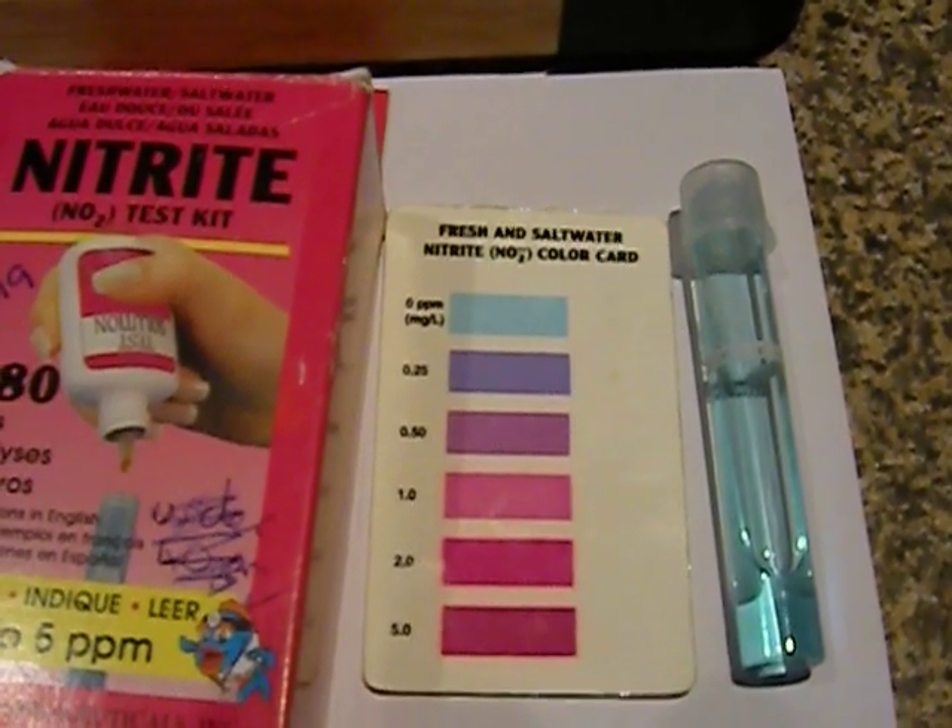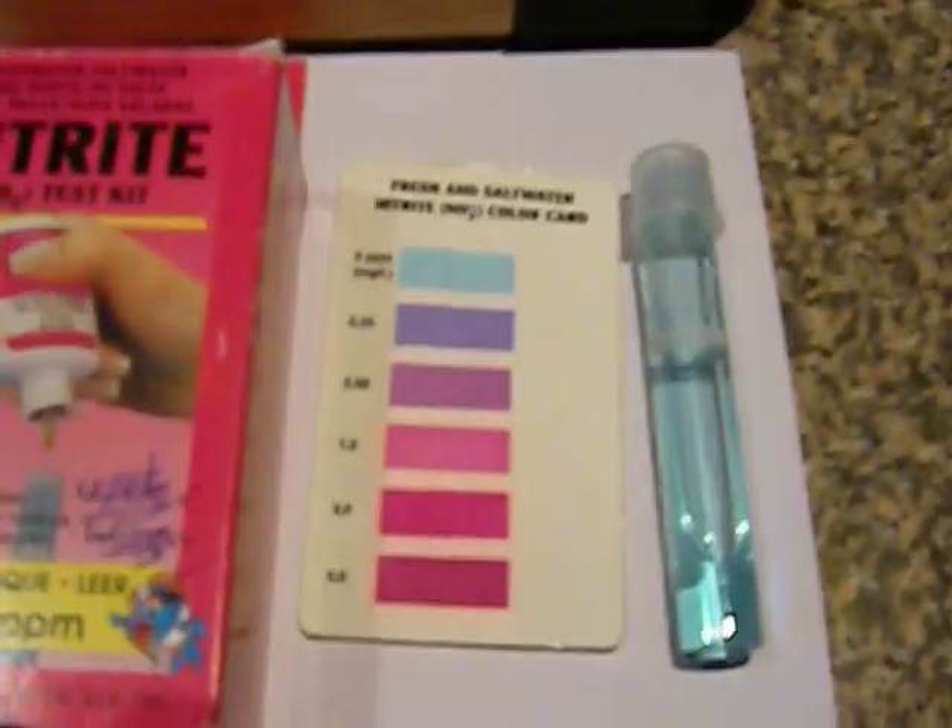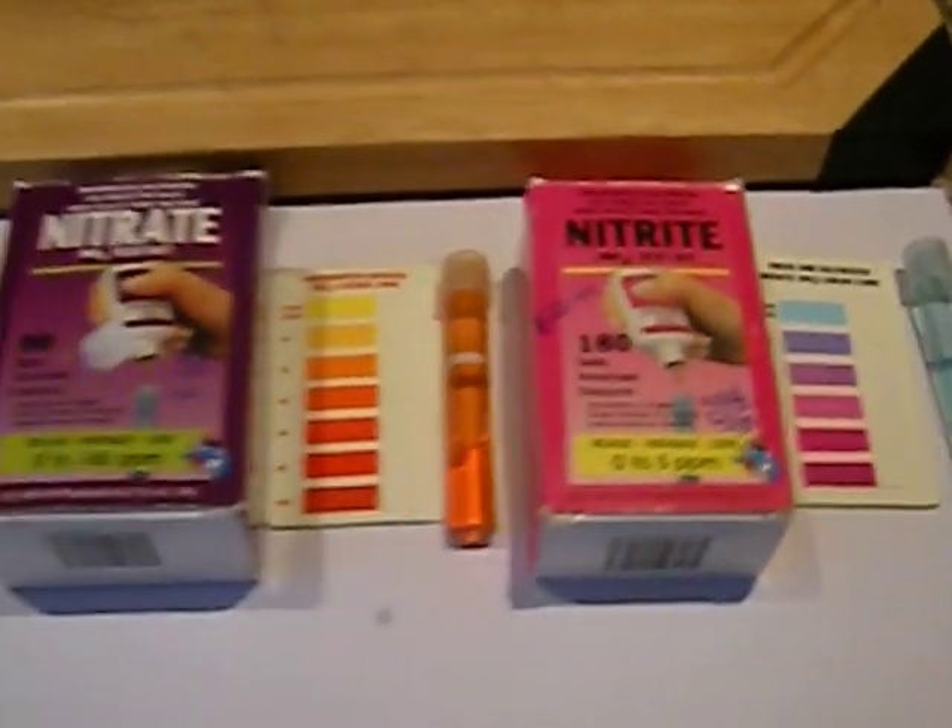This one is your nitrite test kit. Same again — basically drip the suggested amount of drops in. I think this one you can actually compare straight away — you don't have to leave for five minutes — so relatively easy.